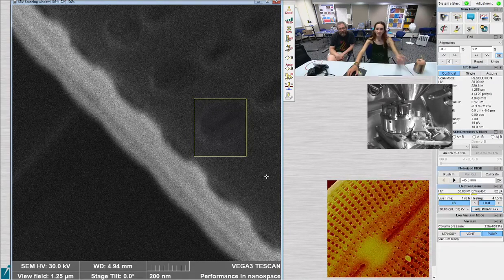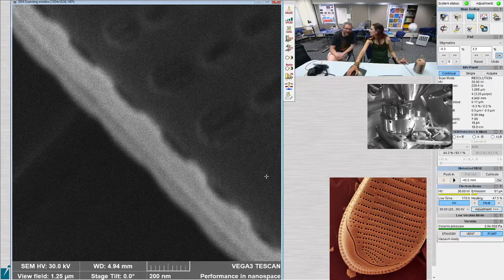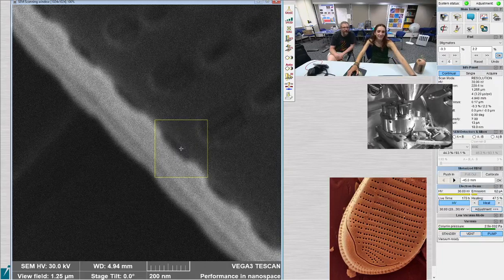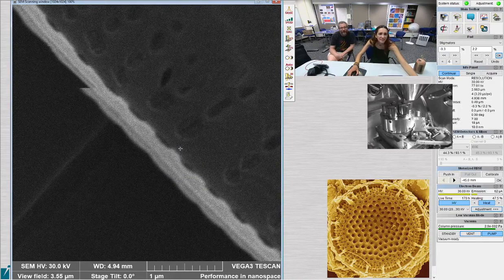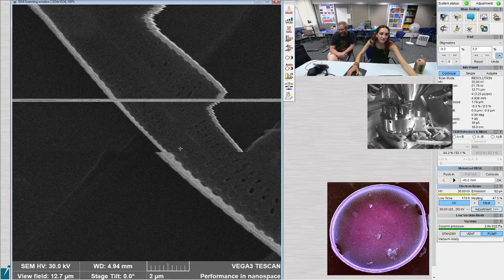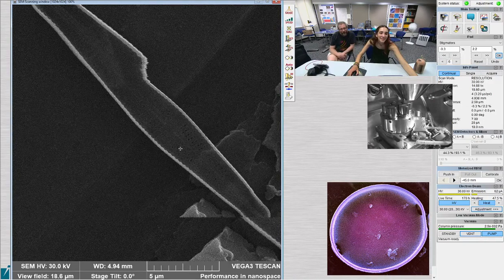I think around there. I think we could do better. Oh, we're at 200 nanometers, that's probably why. We're super zoomed in. I think it'll be okay. Unless we're going to go in and stigmate again, I think it's going to be what we got. It'll be alright. We will make it work.